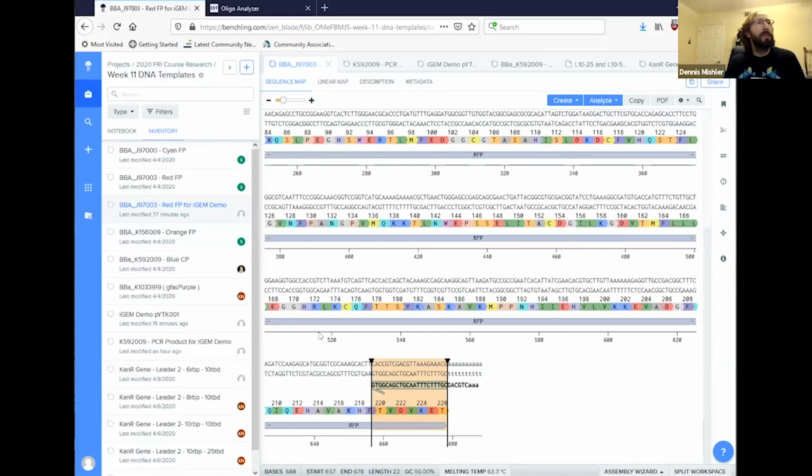Can PCR primers be used to remove restriction sites instead of adding them? Absolutely, yeah. You can do a point mutation. You can do mutagenic PCR, where you change a couple nucleotides within the sequence, and then you do PCR, that removes the restriction site. And then afterwards, you would have to reassemble. Here's what I'll tell you. It might be easier to just reorder the gene using a gBlock or some sort of gene synthesis from a company. But you can use the primers to make mutations like that.